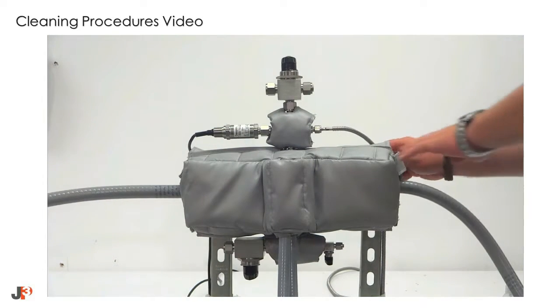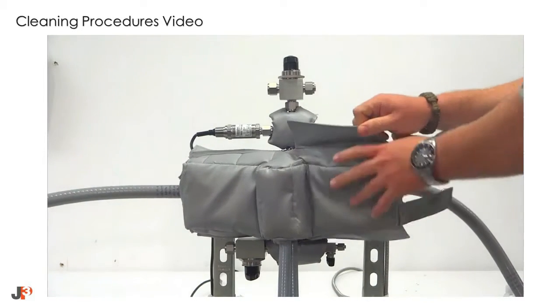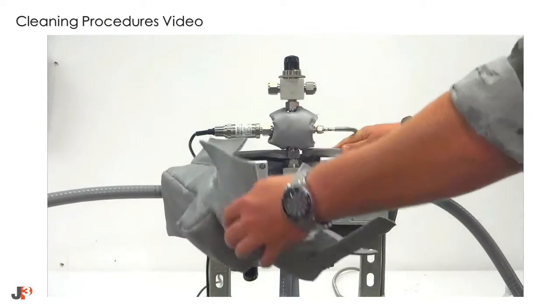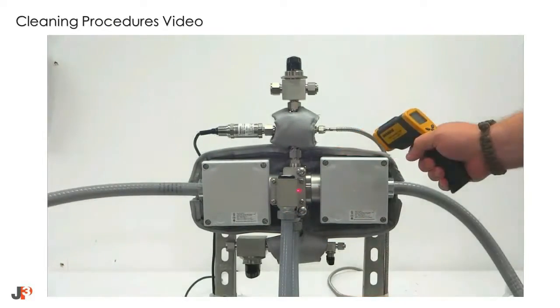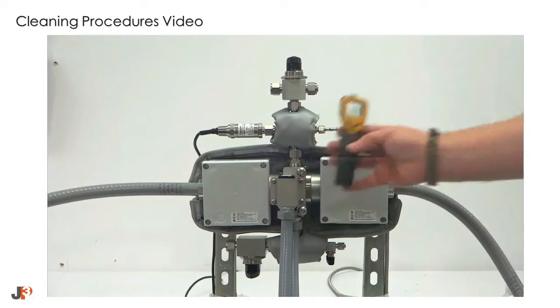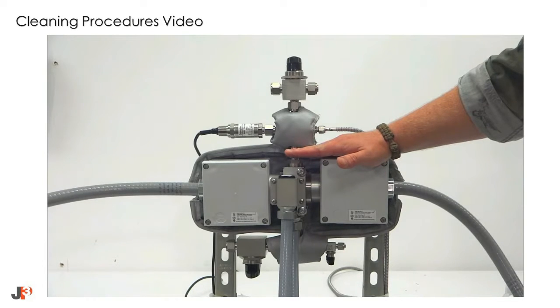Next, remove the insulating cover. It should be noted that not all JP3 flow cells will be equipped with a heating block kit. If yours does not, proceed to the next steps. Ensure that appropriate cooling has taken place by using an infrared thermometer or placing your hand close to, but not directly on, the main block.